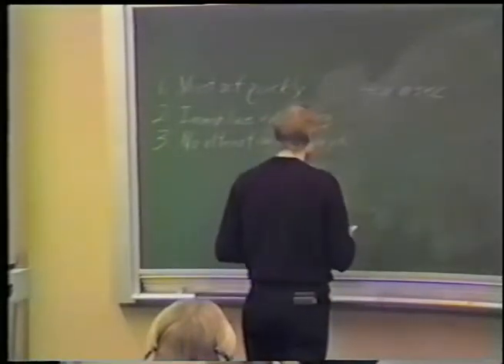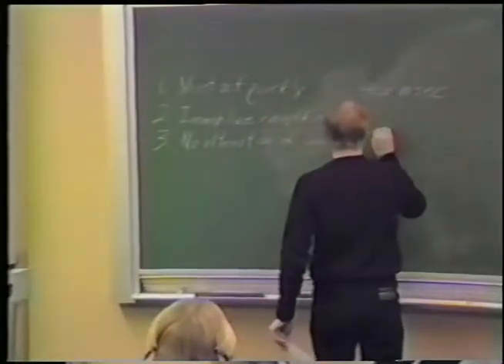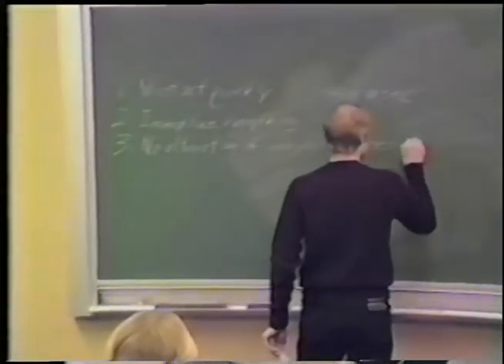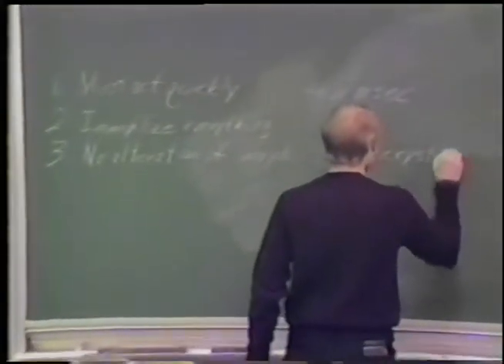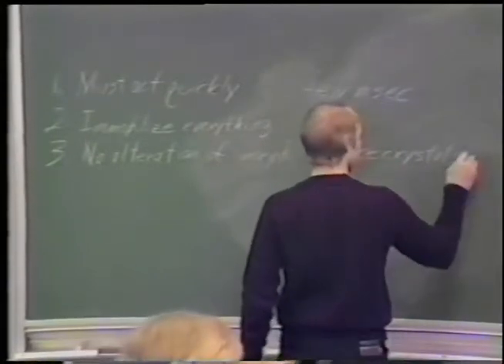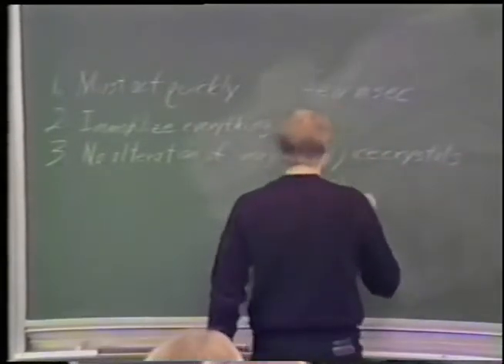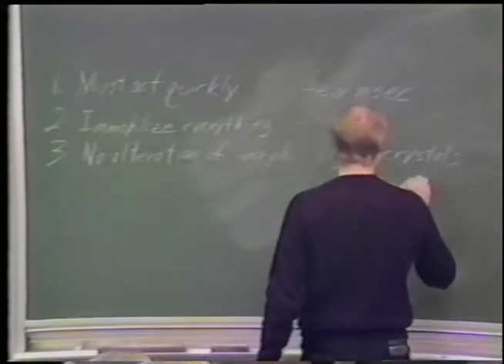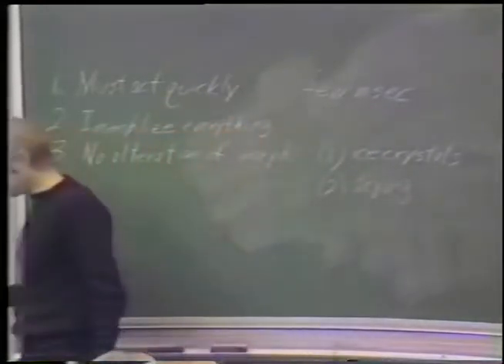Another artifact, now let me just write these down. Okay, this one is easy to recognize. The second artifact that can occur is drying of the sample while you're preparing it for ultra-rapid freezing.